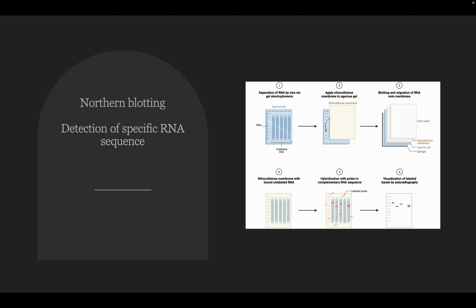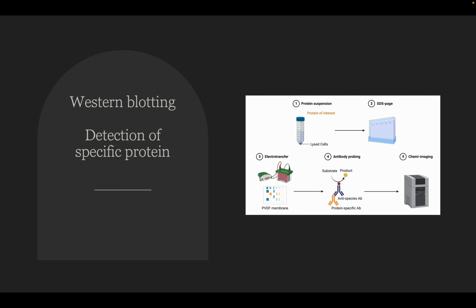With protein, it's very common to use Western blotting, and this technique is very helpful to detect the protein of your interest by using antibodies. Like we were using radiolabeled probes, in this case you can use the chemiluminescence approach and then use an antibody. First, you isolate your protein by different methods, which can be RIPA lysis buffer, SDS buffer, NP40 buffer.